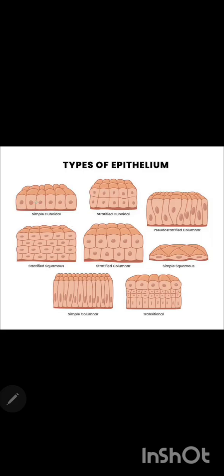So cell layer identification is a must during the microscopic study of any epithelial tissue. Second point, the different shapes of cell in the provided sample.